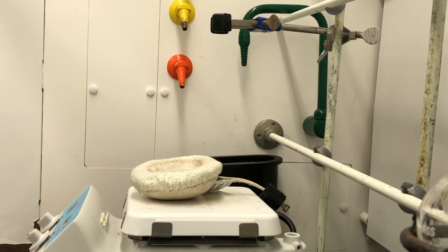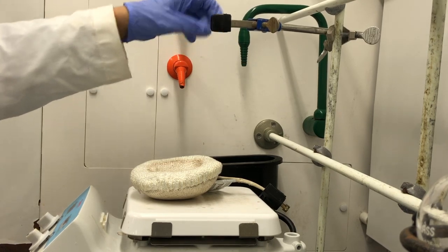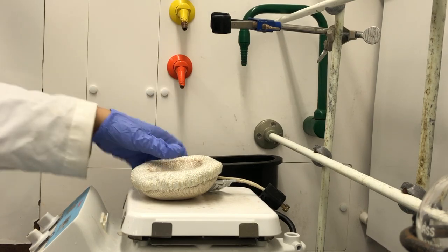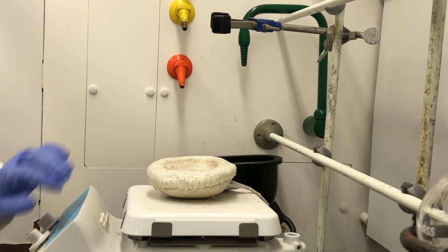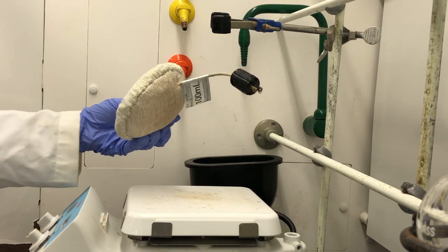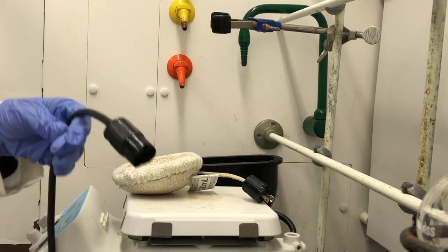We'd like to start by setting up the ring stands. We have a clamp that's supported or clamped to the back wall support. We have a heating mantle on a hot plate. We're really only using the hot plate to use its stir bar function. The heating mantle is going to be used to heat up the solution.